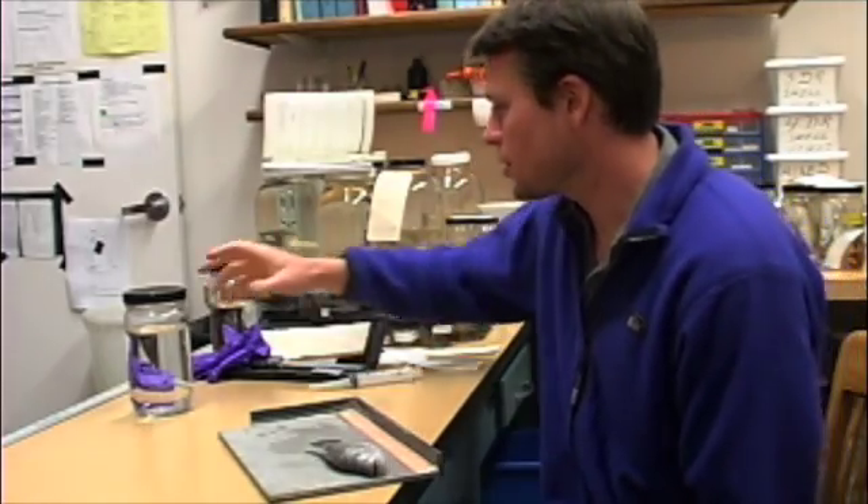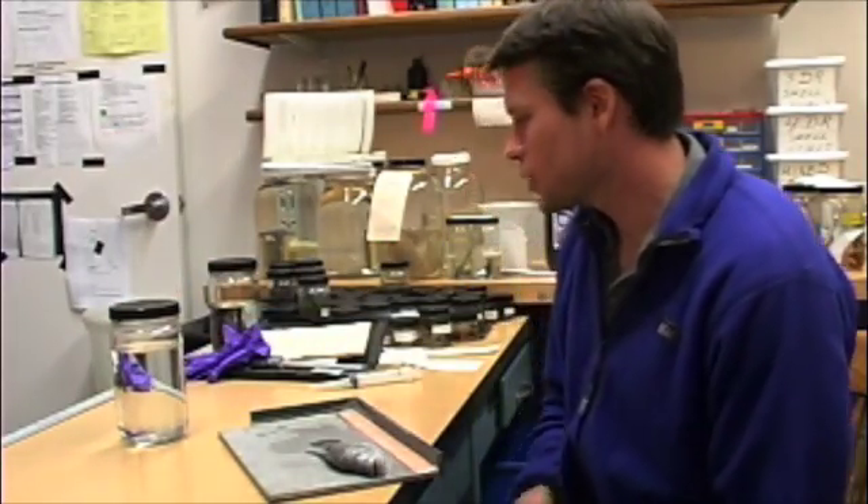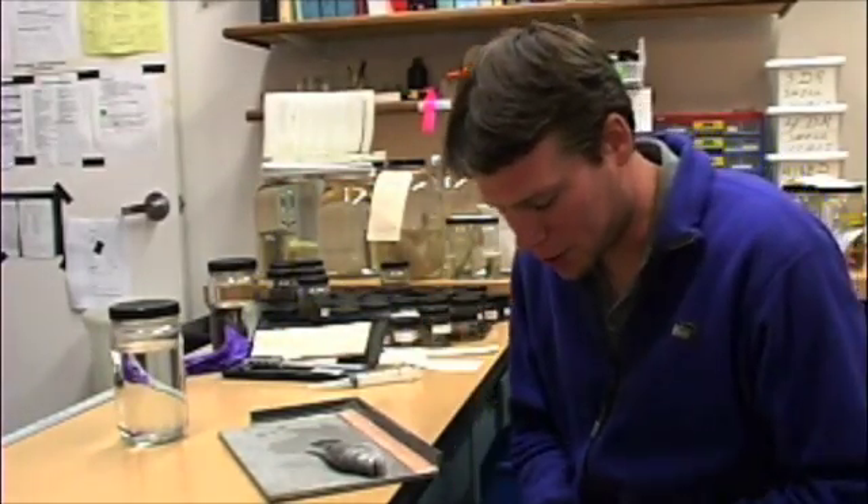The next step is to actually preserve the fish. To do that, we're going to use 10% buffered formalin. The first thing I'm going to do is put on gloves, because formalin is a known carcinogen and it's best to limit your contact with it as much as possible.